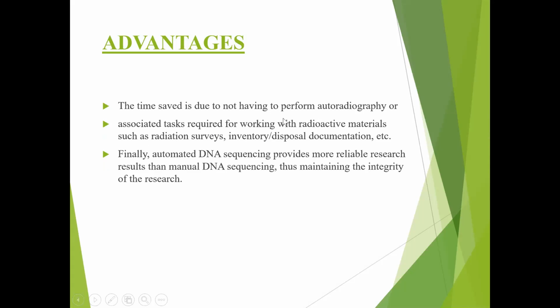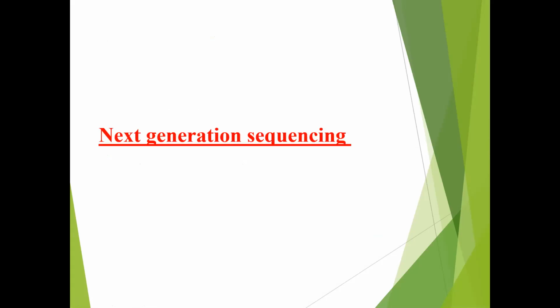As I mentioned, the work associated with radioactive waste is reduced, and it provides more reliable research results than manual DNA sequencing. Thereby, we can maintain the integrity of the research because of the reliability of the results produced by automated DNA sequencing.